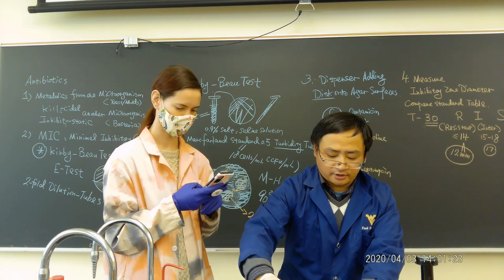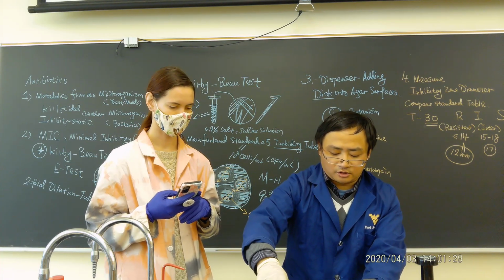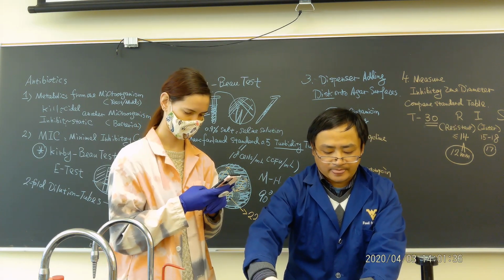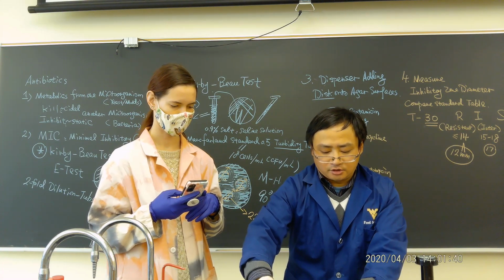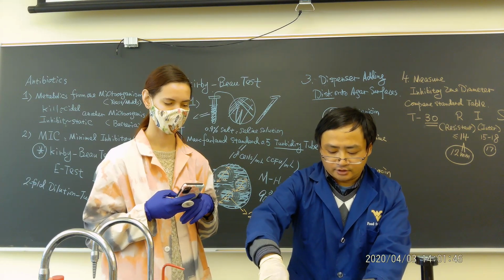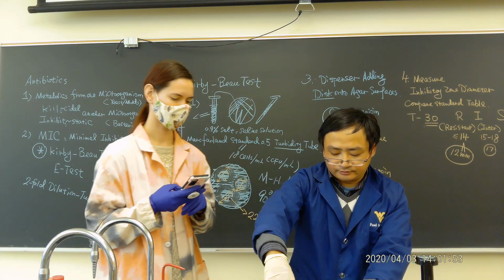So yeah, Karen can take a picture. Very, very gentle. Straightforward. Now turn 90 degrees, do a second pass. But do not put this cotton swab back into the solution, because otherwise you're carrying more bacteria there. Okay, so we can take a picture right here. And we are trying to cover the whole surface, so we do it like that.